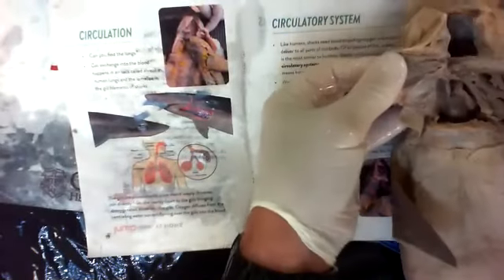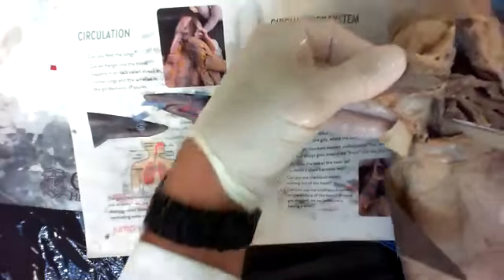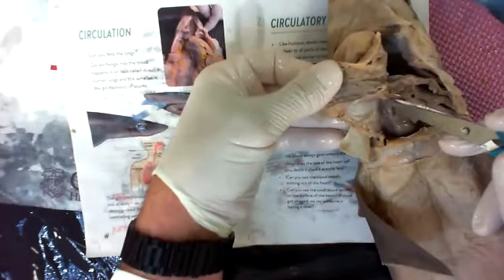In fact, I'm giving you some time, buying some time to open this up. You just want to be able to open it like a book. If you want to cut more, you can. I took the heart. I see the blood vessel coming out, and I don't want to cut that. I kind of like following them along, but it's up to you. If you want to snip, snip, snip so it looks just like the book, go for it.